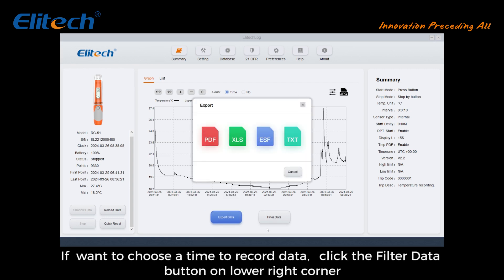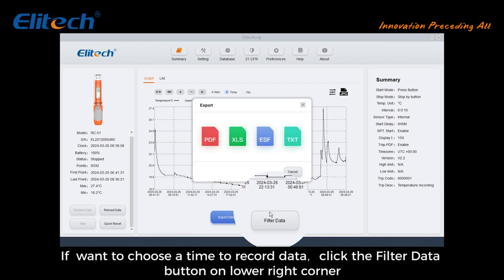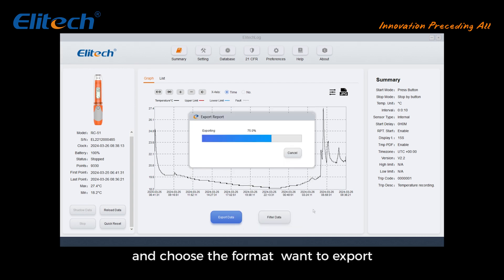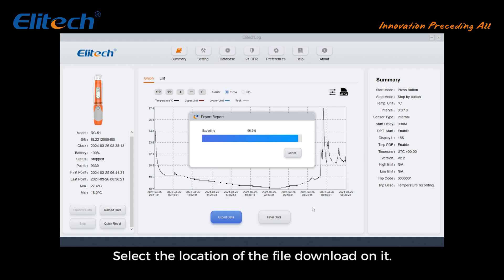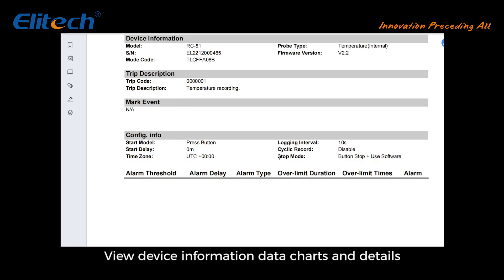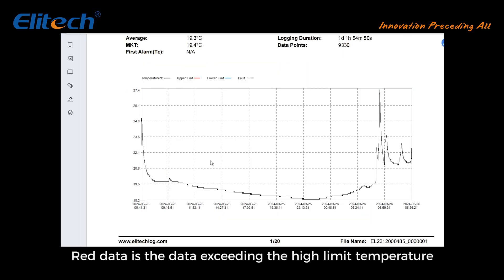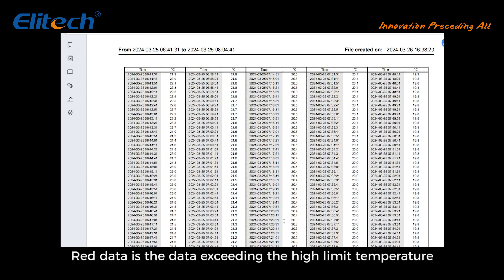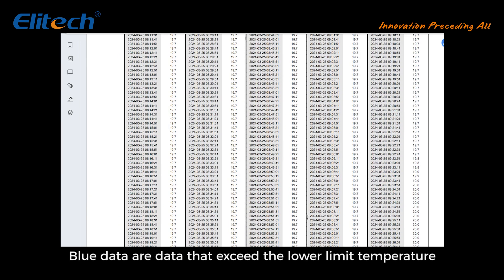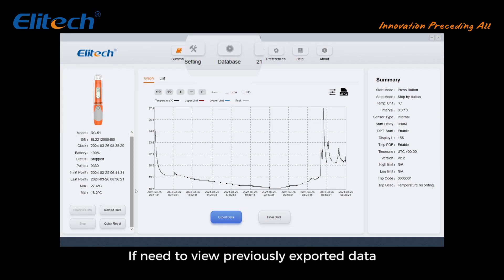After a successful upload, click the Export Data button below. If you want to choose a specific time range, click the Filter Data button in the lower right corner. Choose the format you want to export, then select the file download location. Open the downloaded documents to view device information, data charts, and details. Red data indicates data exceeding the high temperature limit; blue data indicates data exceeding the low temperature limit.